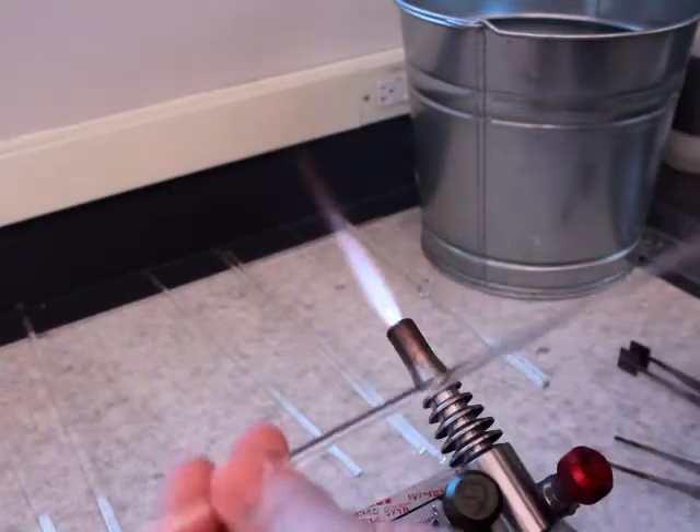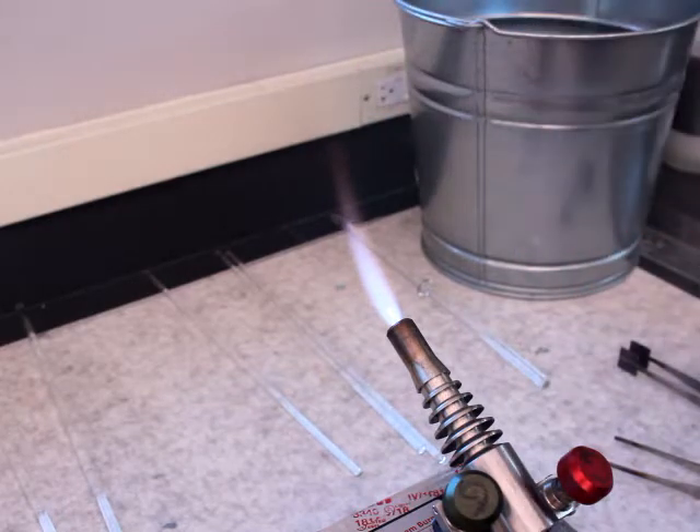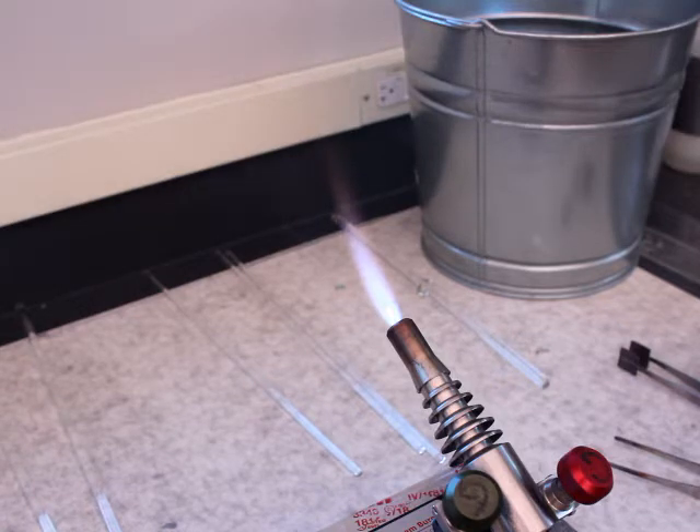I've got a length of 5mm — let me double check that — 5mm glass rod that's been fire polished on both ends.